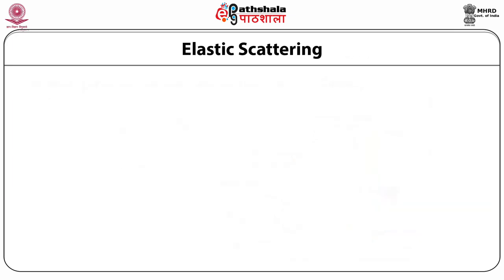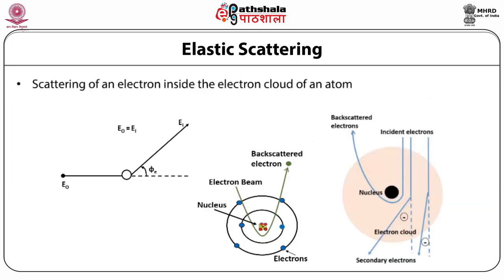The elastic scattering. The electron beam approaches the specimen and electrons with various energies interact with the localized atoms. During this process, the electron trajectory changes and scatters.